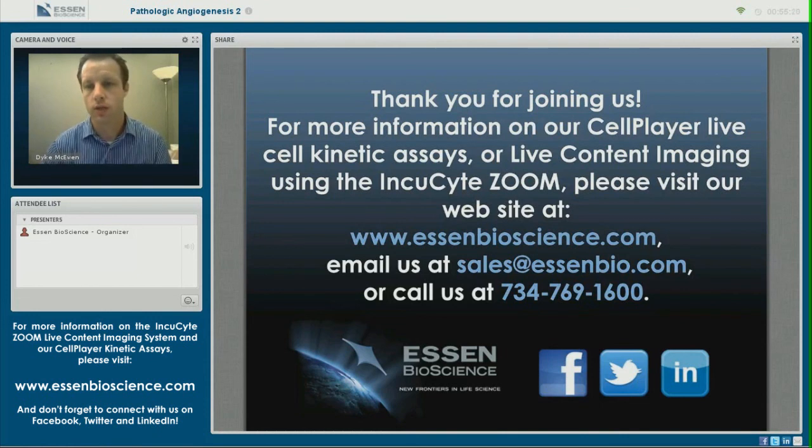Another question is, what is the source of our growth factors? We use basic FGF, FGF2, and the VEGF that we use is VEGF 165. That's the most common VEGF isoform, the one that's been studied most extensively, so that's why we've chosen that VEGF isoform.